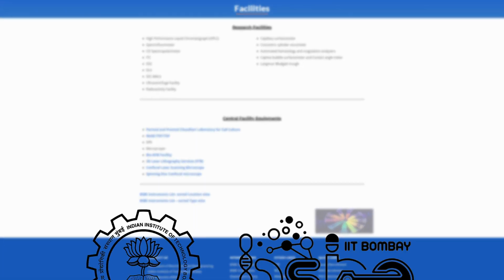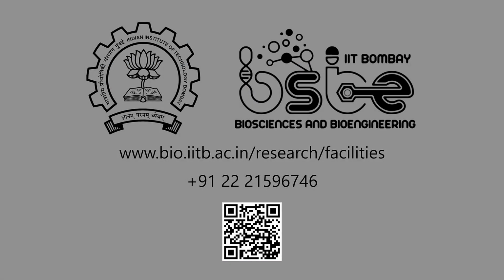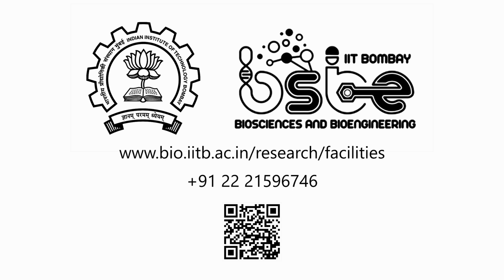A full list of facilities is available on the webpage of the BSBE department. Please feel free to contact us if our facilities can be used for any of your research requirements.